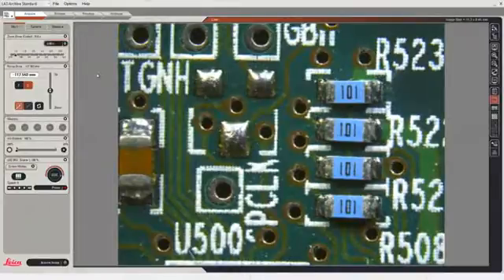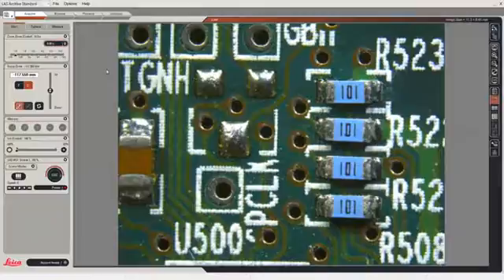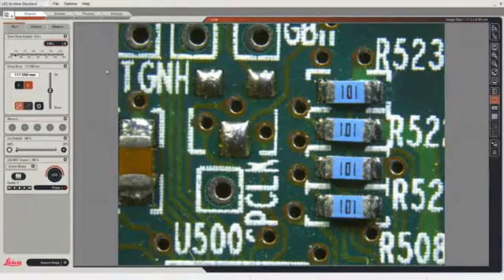The illumination and aperture controls can also be adjusted if necessary. But the image on the screen now looks good, so we can proceed to the next step of capturing the image.